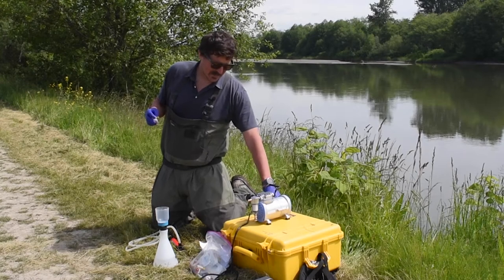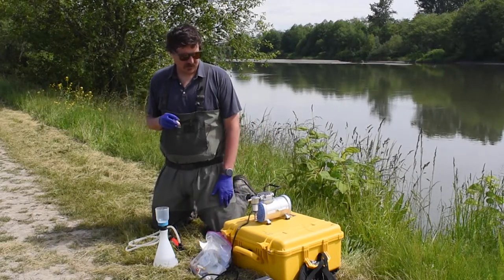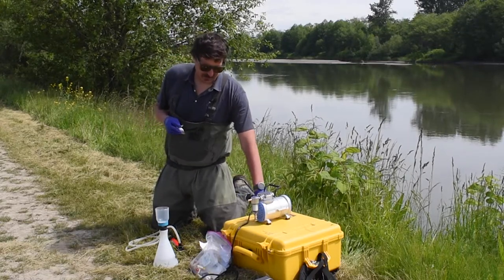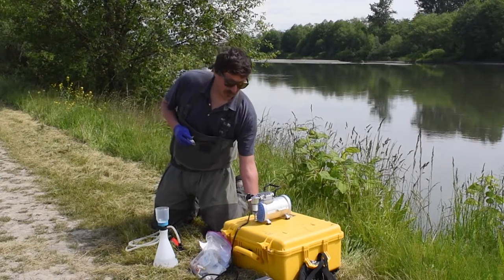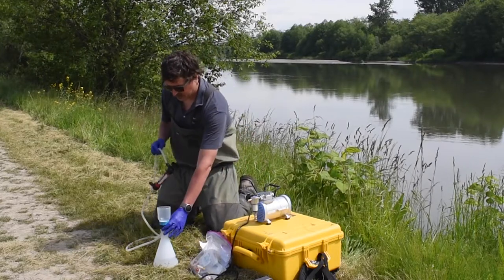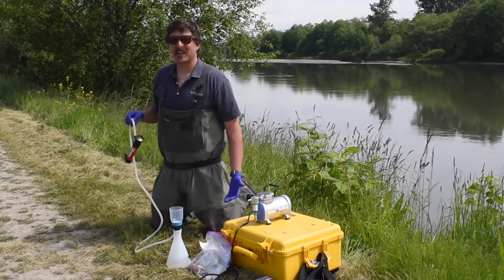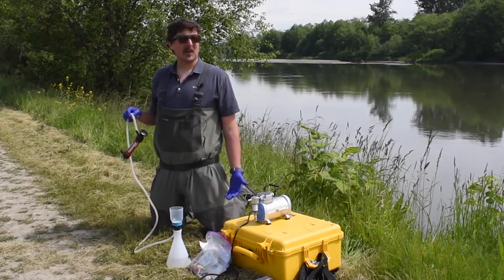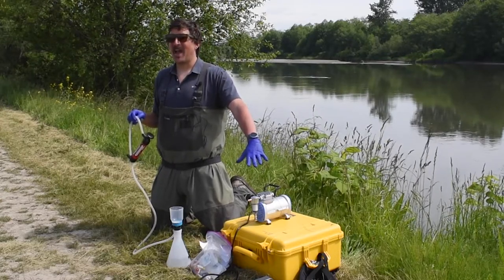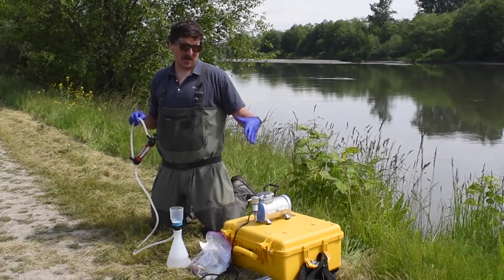I have three of these kits that we made. I've been checking them out to the tribes and eventually I'll have a couple for each tribe. Everything's in there — it's a fully self-contained backpack. They're heavy and uncomfortable; you wouldn't want to hike 20 miles with this, but if you need the front country setup it works well. If anybody's thinking about eDNA and considering buying a $3,000 Smith Root backpack, come talk to me first — this is about $500, and I've done a side-by-side comparison with Smith Root equipment and it works just as well.